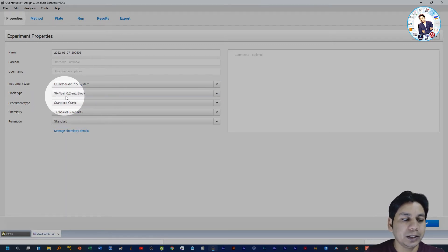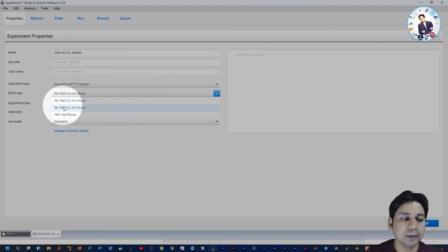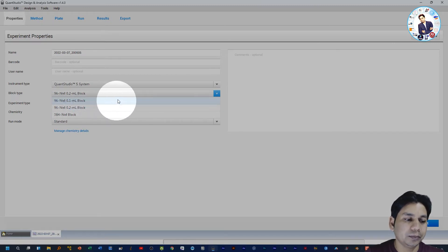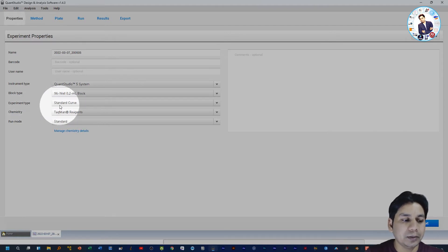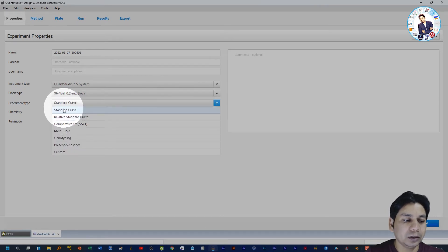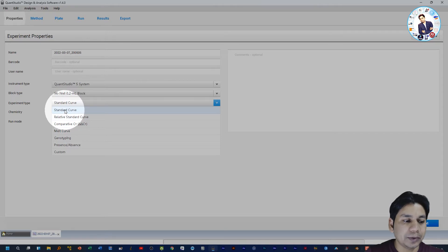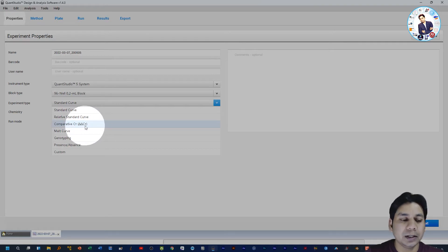For Block Type, the default is 96-well 0.2 ml block, but if you want to change it you can select from the dropdown menu. I am leaving the default. For Experiment Type, by default it is Standard Curve, and if you click here you can see other options such as Standard Curve and Relative Standard Curve.